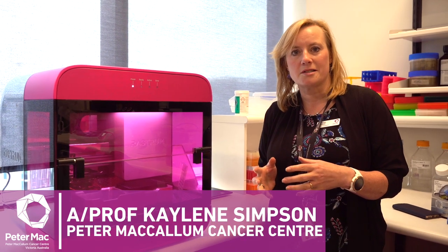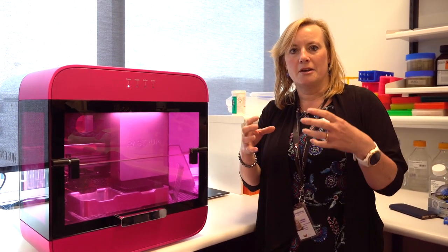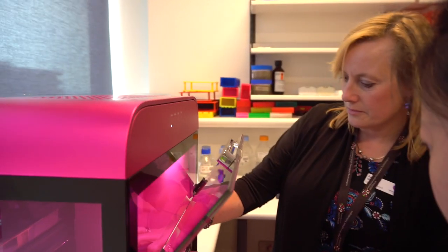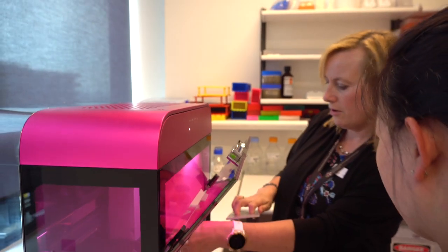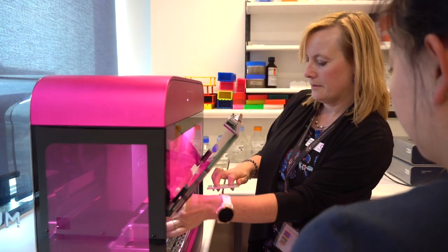What this instrument's going to do for us is allow us to seed cells in a three-dimensional array in a scaffold type of gel called a bio-ink, and we're going to be able to do this on a massive scale. People can already do this in research labs, but to be able to do this in such a high-throughput fashion, in such a robust way, and to take patient samples and analyse them in a very reproducible manner is going to really change the way we can do cancer discovery research.